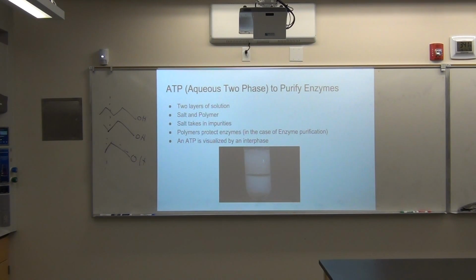And so someone had the idea, I don't even know who it was, to saturate the tris, to increase the concentration of the tris for another experiment. And we said, well, wait a minute, what if we use that saturated tris buffer to extract the enzyme from the powder? And we did that, and we found that it lasted much longer.